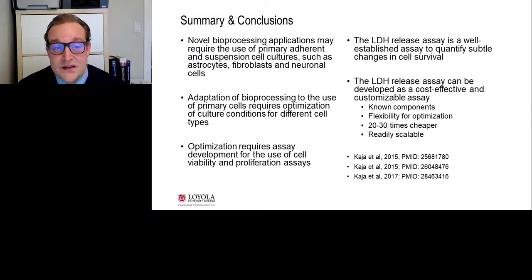Our LDH assay can be developed as a very cost-effective and customizable assay. It consists of known components. It's got a strong flexibility for optimization, as I've shown you in this presentation. It is about 20 to 30 times cheaper than commercial solutions, and it is very readily scalable.